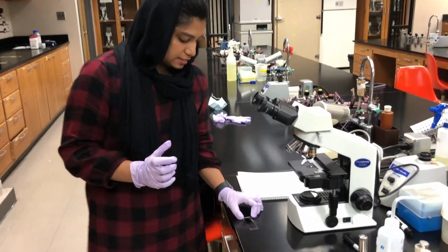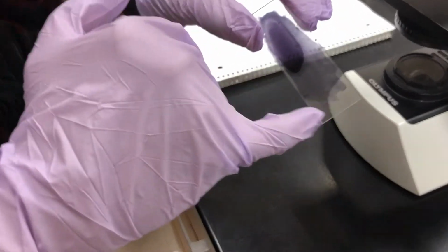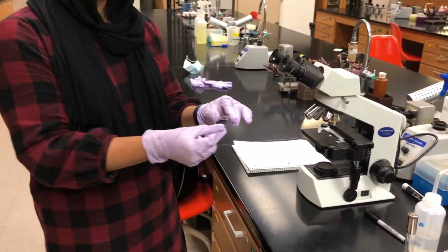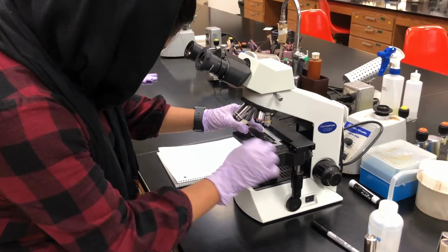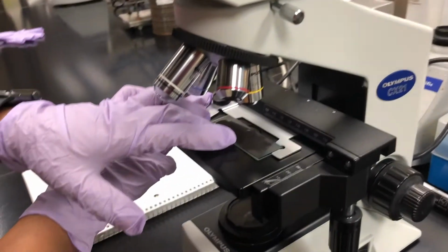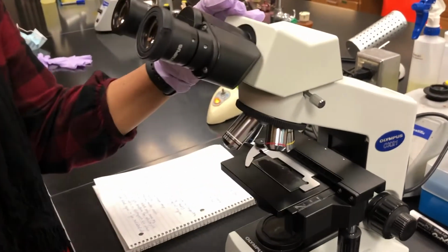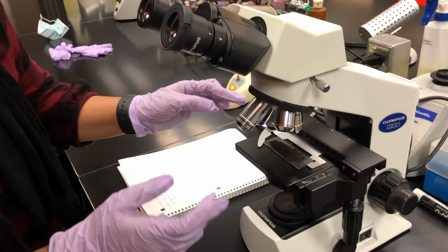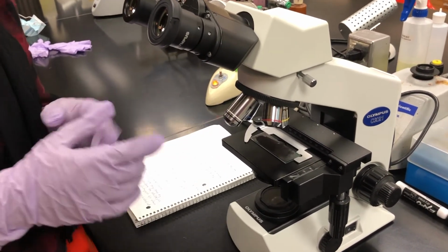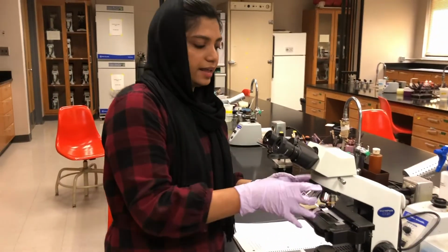And this is the slide that we have got, and you could see this part has dried a lot, so I'm going to place the slide on the microscope and just view what we could find. First I'll be viewing in 4x, and then I'll be gradually moving on to 10, 40, and finally I'll be ending up in 100x. For 100x, as you guys are familiar, we'll be adding a drop of oil and then visualizing that.